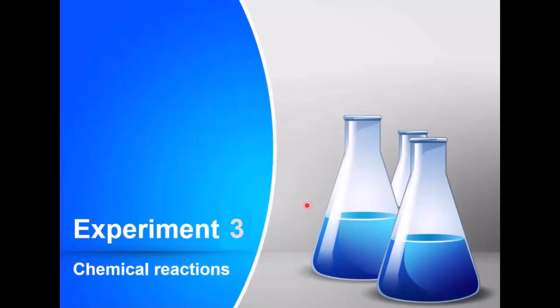So that's it. This is a very qualitative lab. You're looking at what happens for each of the test tubes when you mix the components together. You're going to carefully feel the test tubes to see if it gets hot or not. And you'll look for color changes. You'll look for bubbles as evidence of reactions occurring. But fundamentally, this lab supports the lecture in that you need to predict the products of the reactions. You'll go over that with your instructor. And you need to balance the equations, and then you can qualitatively describe what happens as you watch each reaction occur.